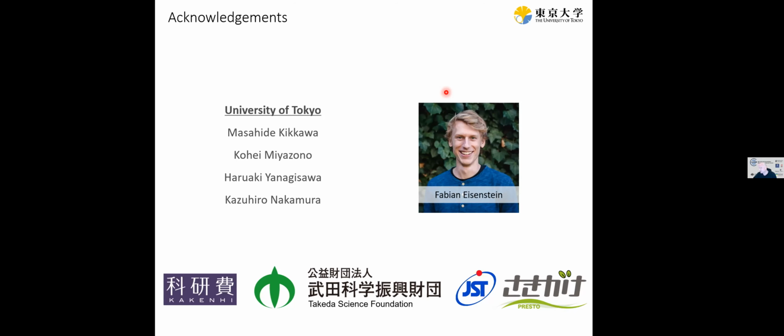The hexagold grids, do you think they'll make much of a difference? I hope they will. They're still the gold grids. I had a chat last week at the Gordon conference with Katerina and Chris Russo. They were both there, and Katerina gave a talk about the gold grids. What she said is, with these grids, they seem to get very uniform ice thickness across the hole. If that's true, of course, it depends on the sample, the concentration, and so on. But if we can get even more consistent and reproducible sample prep, of course, that will help.